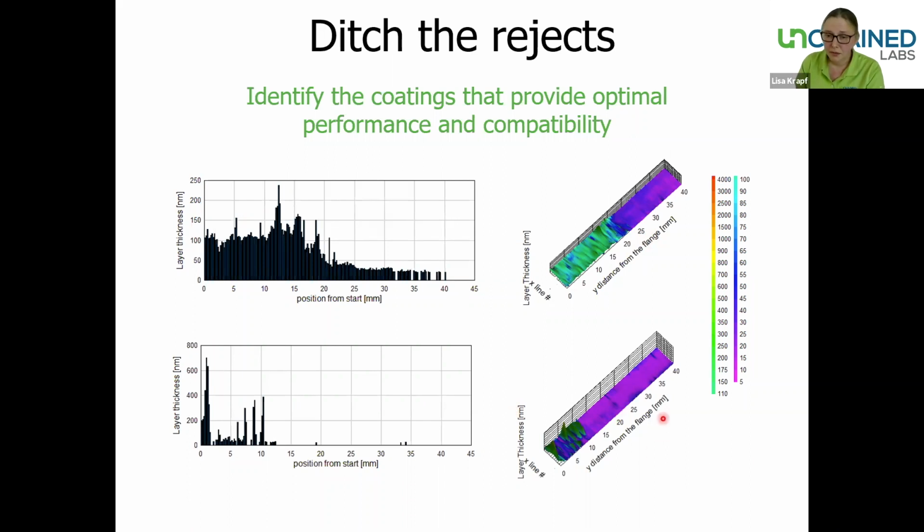Another syringe was tested, and this one's here below, where we can see that we have some silicone, but only close to the finger flange, and then there are large areas of the surface where we don't detect any silicone at all. So for this one, probably the risk would be pretty high that you would need a huge force to move the plunger through the syringe.